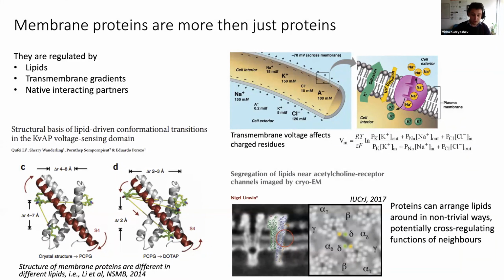So it's possible to do very pretty structures at high resolution, and they're very relevant in nanodiscs. But today I want to focus on a tomography project that we have been looking at, a structure of ryanodine receptor in native membranes. And I'll guide you through our workflow, how we try to get to higher resolution from subtomogram averaging.